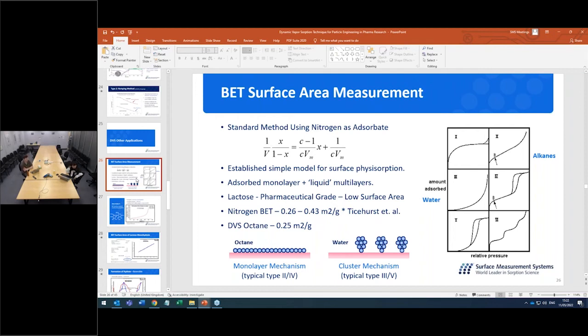We do have different methods. We have an applicational summary of the different methods we can use to determine the amorphous content. The method I'm introducing today is based on the crystallization of the material. It's sensitive for low amorphous content material. We have some papers or application notes related to that. If you're interested, I can share some more documents with you after the meeting.